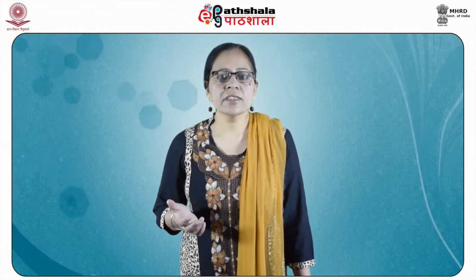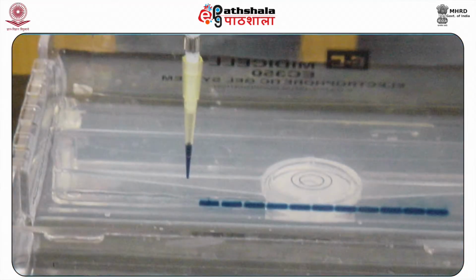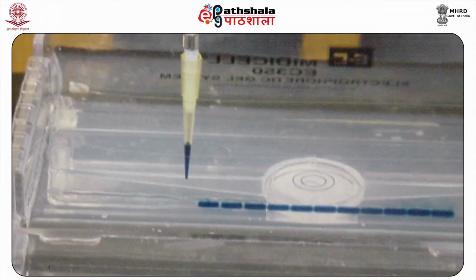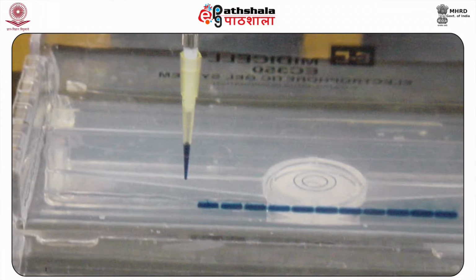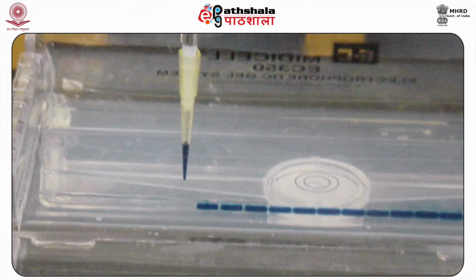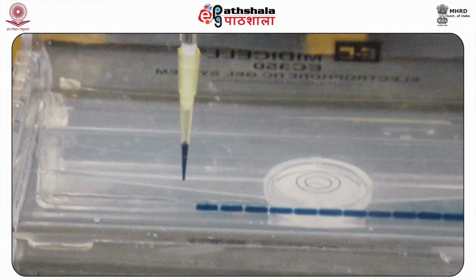Various other types of agarose are present which have lower gelling and melting temperatures as compared to standard agarose. Recovery of material from the gel is enhanced by such properties. The concentration of the agarose gel determines the pore size and sieving characteristics of the gel. The size of pore is small with higher concentration. These gels are fragile and should always be handled with care. They are held by hydrogen and hydrophobic bonds, which make them brittle.